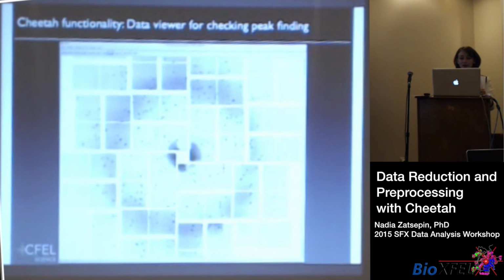This is another reason why we need to get really, really good statistics and combine a lot of patterns from a lot of samples, because we simply have not sampled each diffraction spot's intensity sufficiently in a single shot.